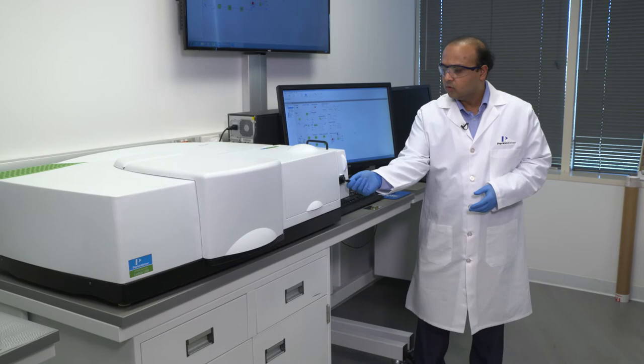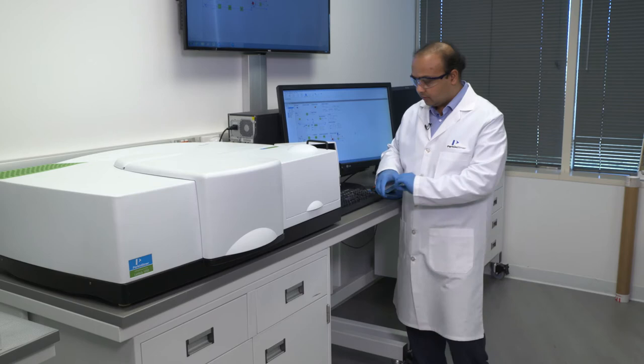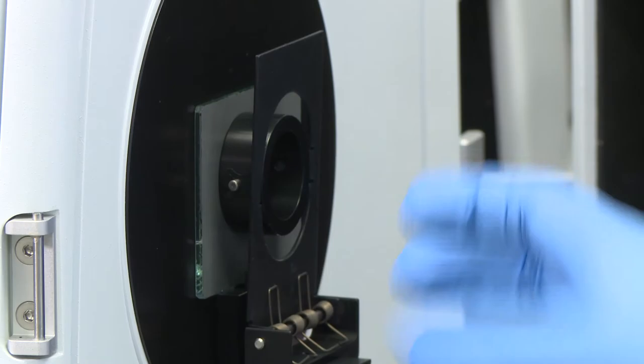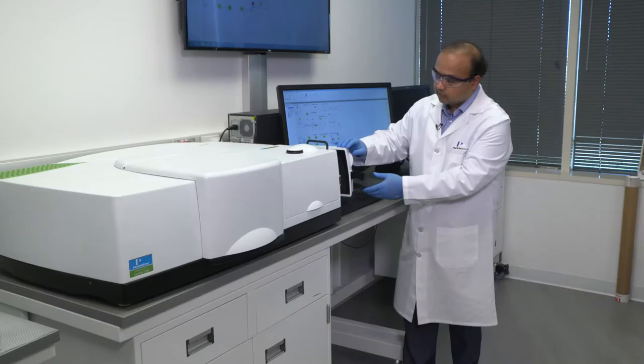In order to make reflectance measurements on the sphere, we will use the back port of the sphere. And in this example, I have a glass mirror, which I'll take off the spectralon and position the glass sample here. Again, this is spring loaded here, so it goes right in place. And we're able to make, once we close the door, we're able to make total reflectance measurements on the sample.